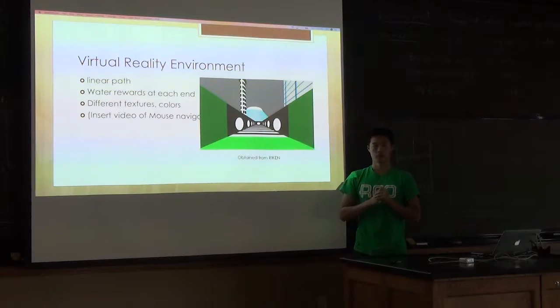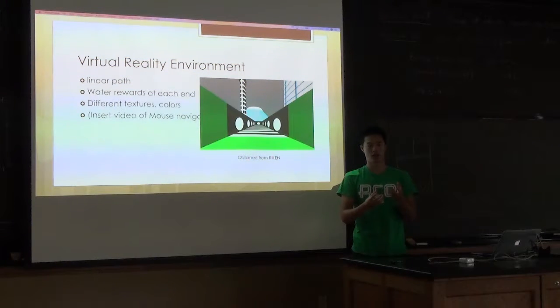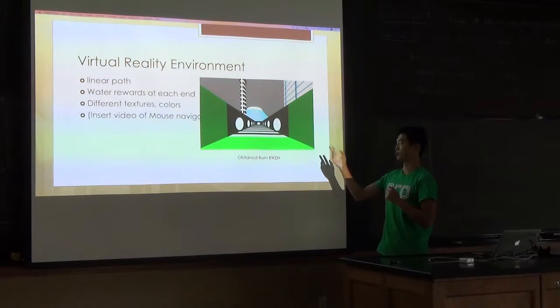Are they on a wheel? Yeah, they're on a ball. On a what? On a ball. Okay. Is that like a wheel? I just know the wheels. So the ball is suspended on a column of air, and as they run along it, the ball moves. Okay, so they can run on it. Yeah. So it's a fancy wheel, basically. It's not a wheel at all, but you know. No, yeah. Keep going.